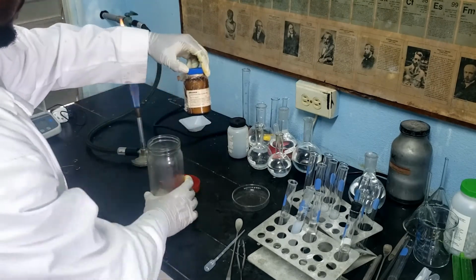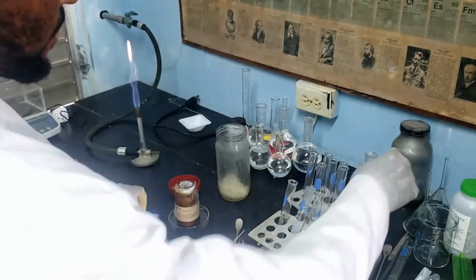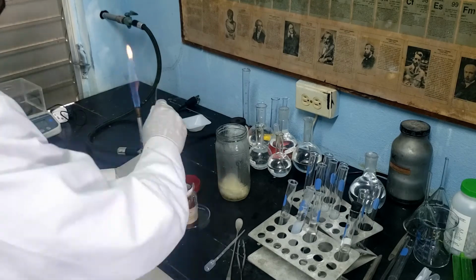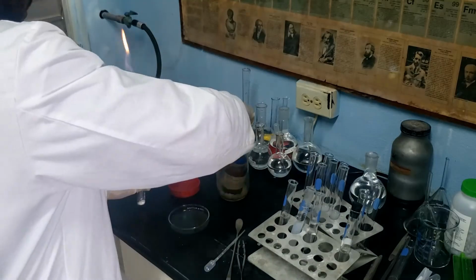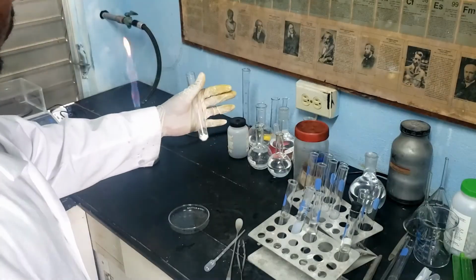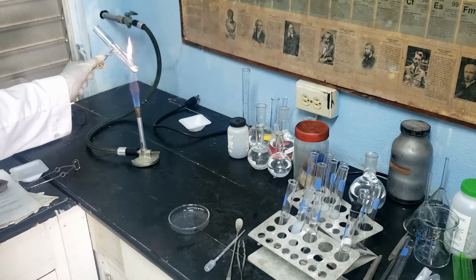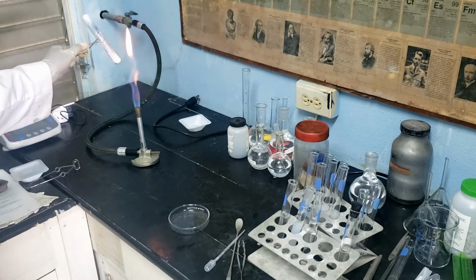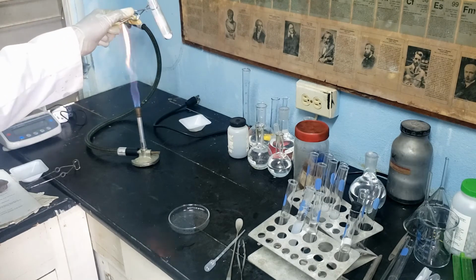Anhydrous aluminum chloride is very difficult to store, especially in Belize's humid climate. Notice as I open the bottle, you can see some smoke coming off. Although I have the bottle in another container with a plastic wrap, this still does not prevent the reaction from occurring. The white gas being produced is actually hydrochloric acid being formed as the gas reacts with the water in the atmosphere.